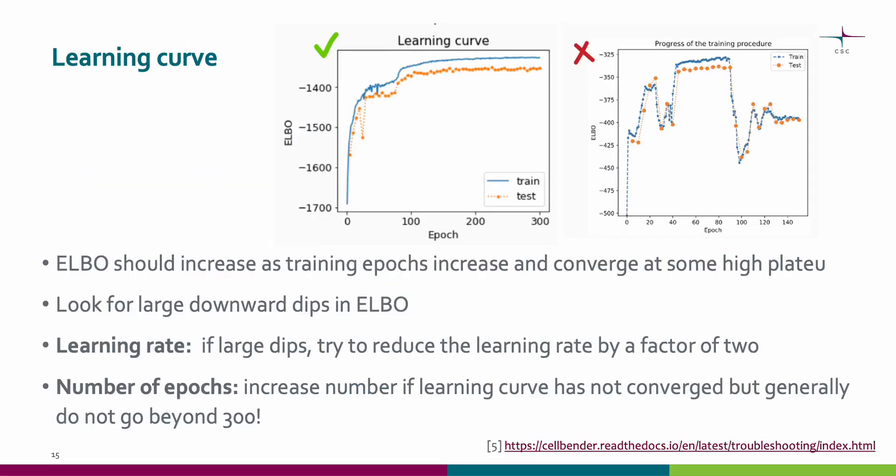Now we will move on to another type of plot in the report file — learning curves. On the left is an example of a good learning curve where the elbow increases as training epochs increase, after which it converges at a high plateau. On the right is an example of a bad learning curve where you can see large downward dips in the elbow. If you see these large dips, try reducing the learning rate by a factor of two. If you see that the learning curve does not converge at a high plateau, you can increase the number of epochs, but generally do not go beyond 300.